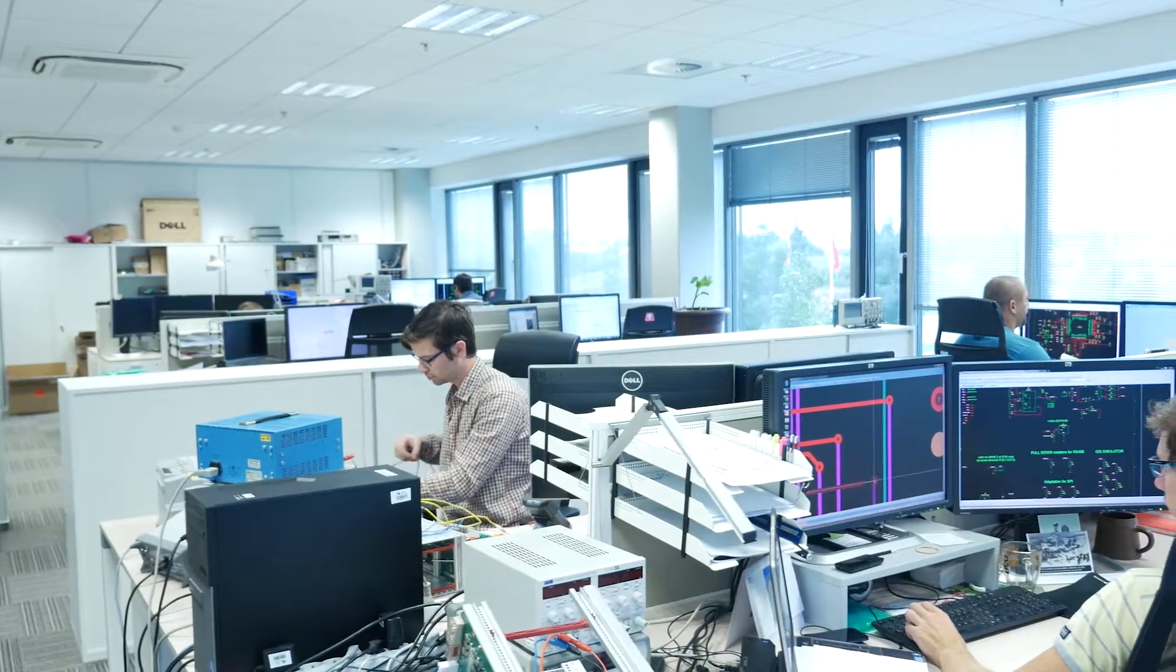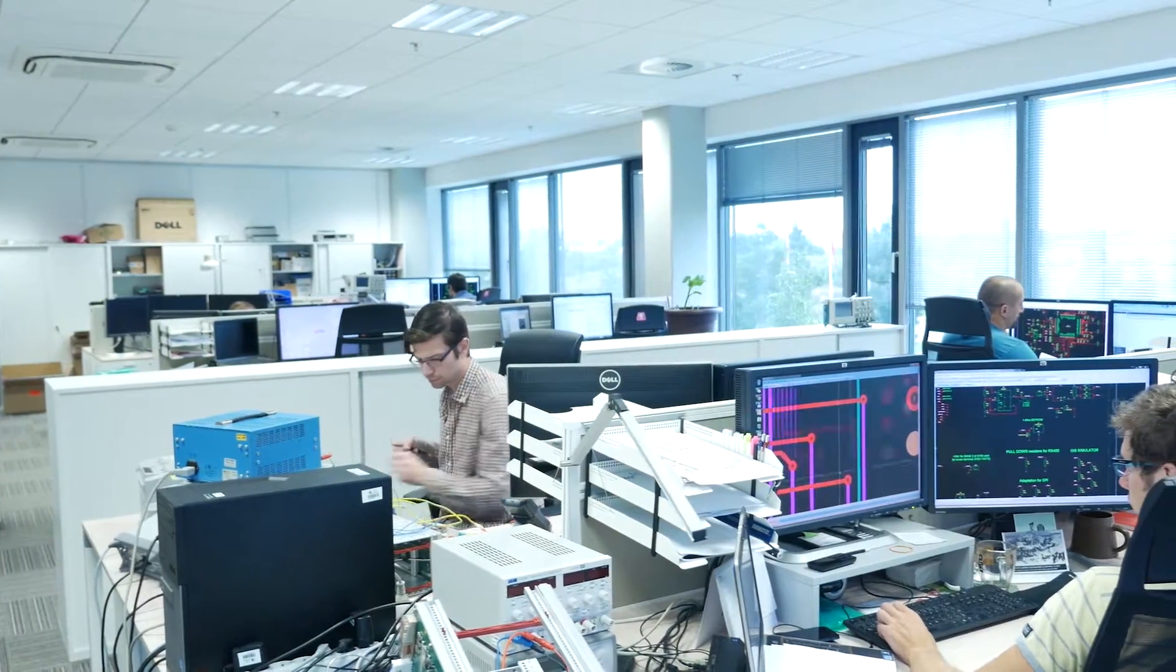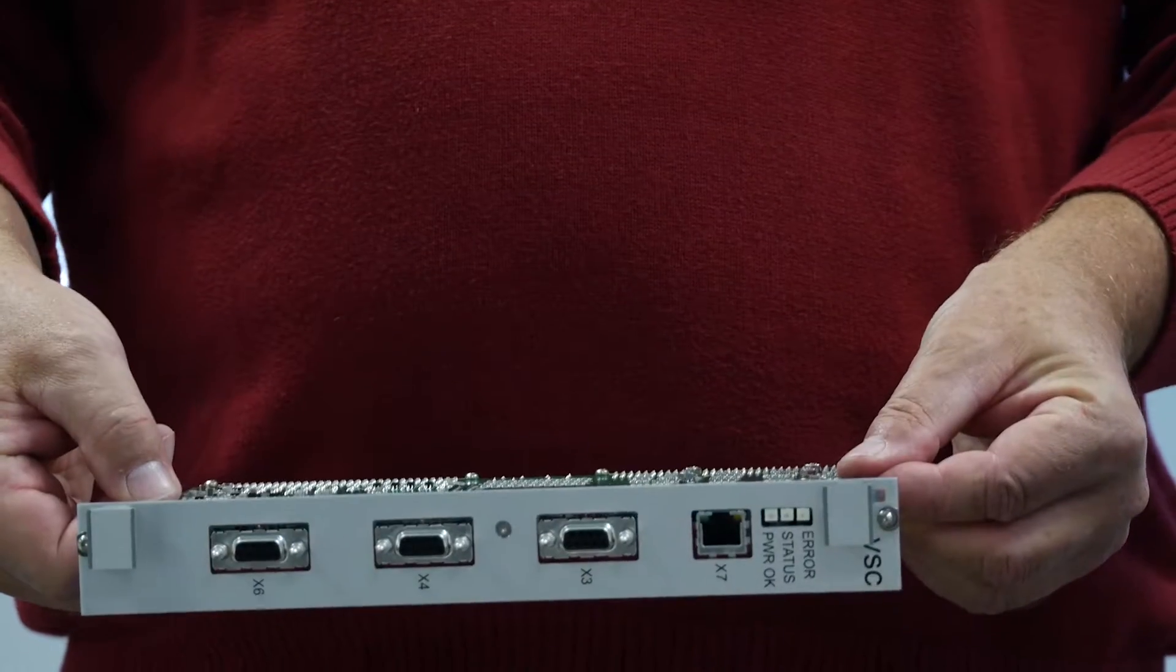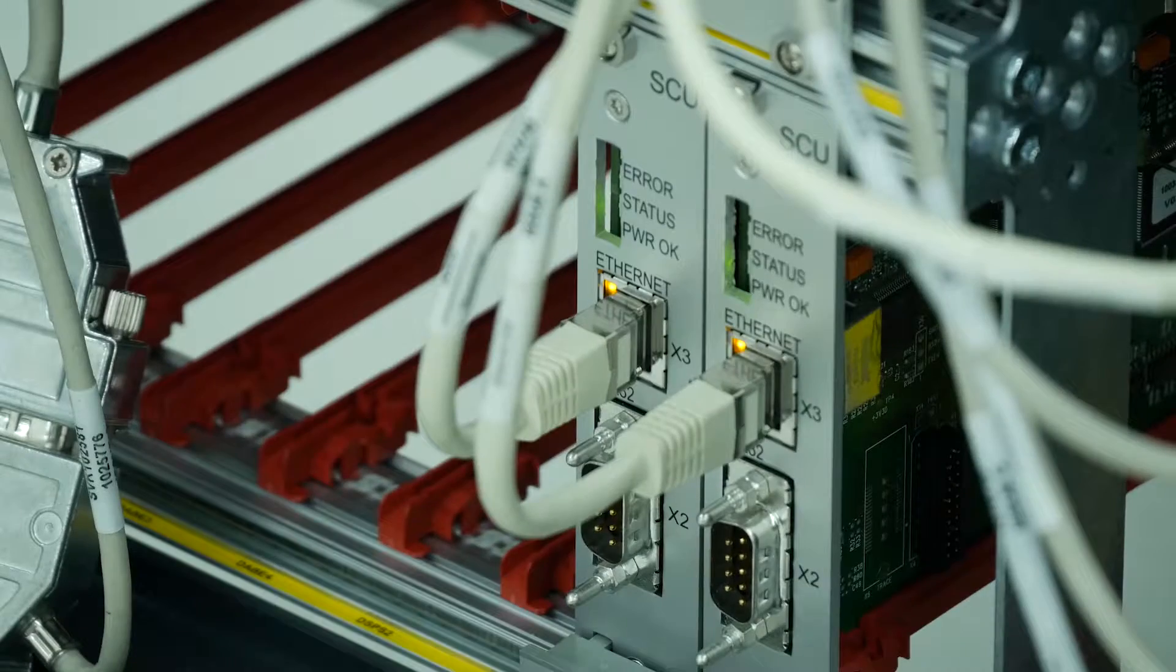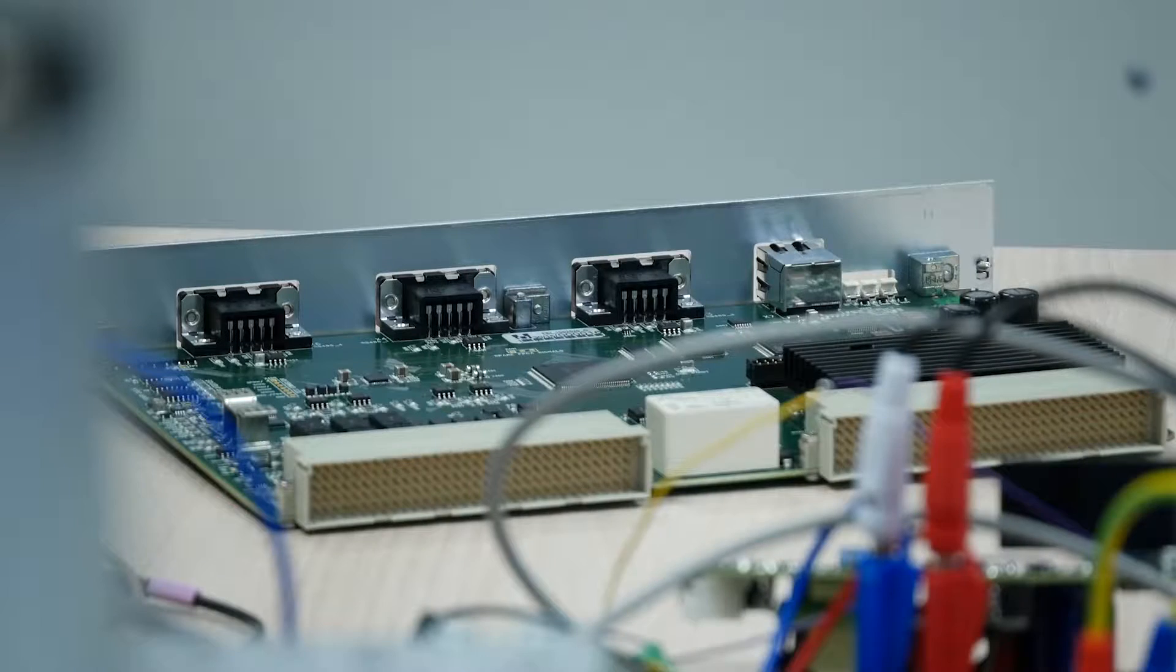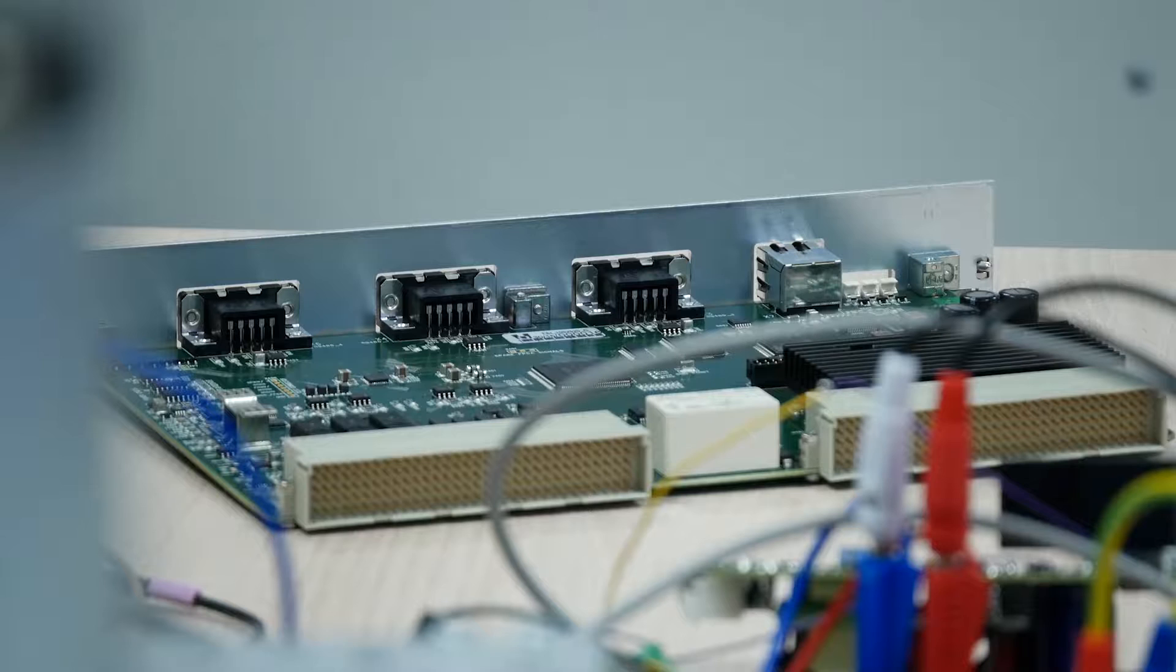Every electron microscope needs several dozen electronic boards for it to properly work. Wait a minute, let me guess. Very precise voltage will be needed again, so these are not just common boards.